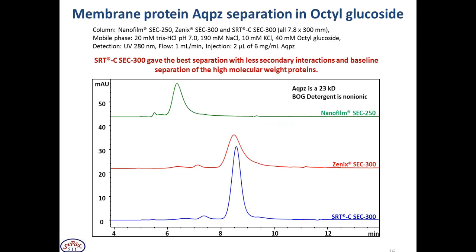Aquaporin water channels, Aqpz, transport water molecules across the membrane. Here is Aqpz in complex with octyl glucoside. This is a non-ionic dialysable detergent that is used for the solubilization and isolation of membrane proteins.